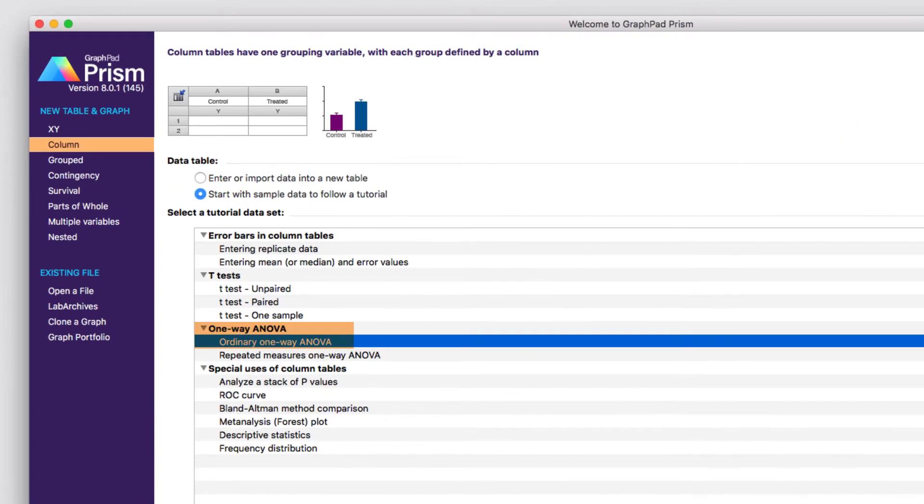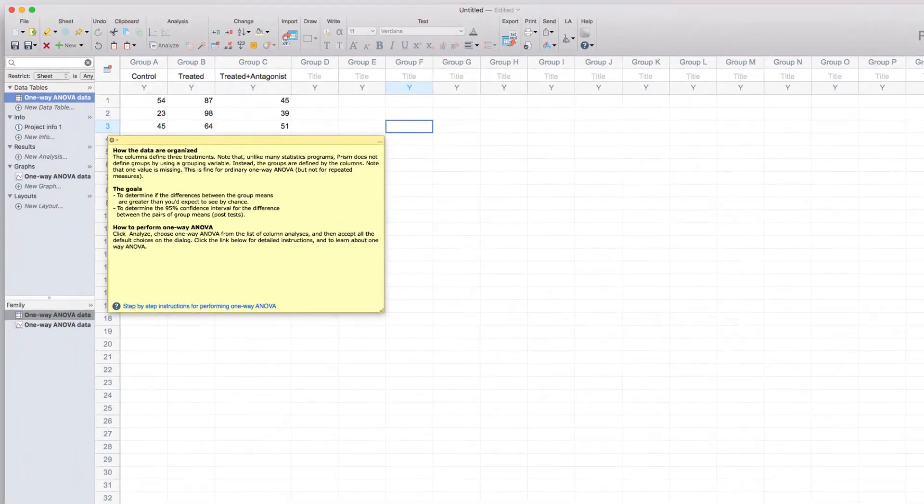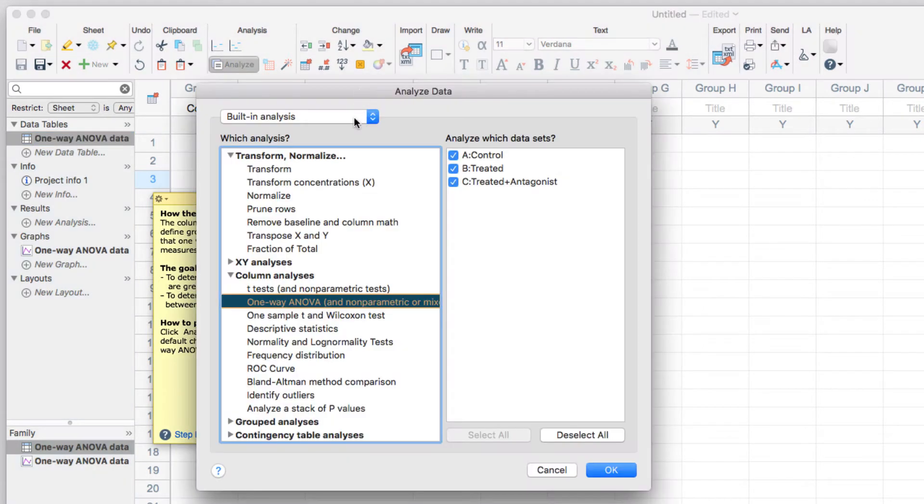To do that, I'm going to use the ordinary one-way ANOVA tutorial data set from the column data table, and click Create. I'm immediately going to analyze this data using a one-way ANOVA by clicking Analyze, selecting one-way ANOVA, and clicking OK.